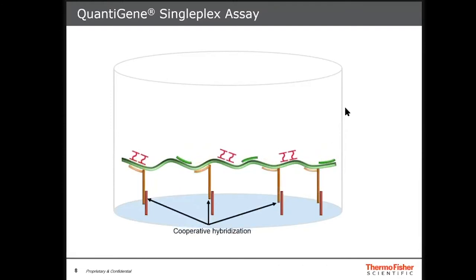So probe set is a family of oligos that have basically 3 different functions. There are areas of unique sequence that you see here. These are called capture extender probes that are binding to the target. And then each one has the same universal tail. These are all single-strand DNA. It's going to hybridize overnight at 55 degrees. We have an overnight hybridization for capture.